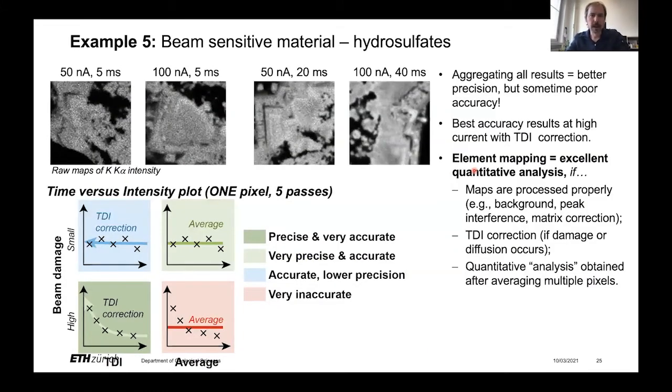Just for the fun, these are animated GIFs of these maps that I just showed you. And we can nicely see the migration, basically, of the potassium leaving, for instance, this area to migrate into this domain here. And the same goes for here.